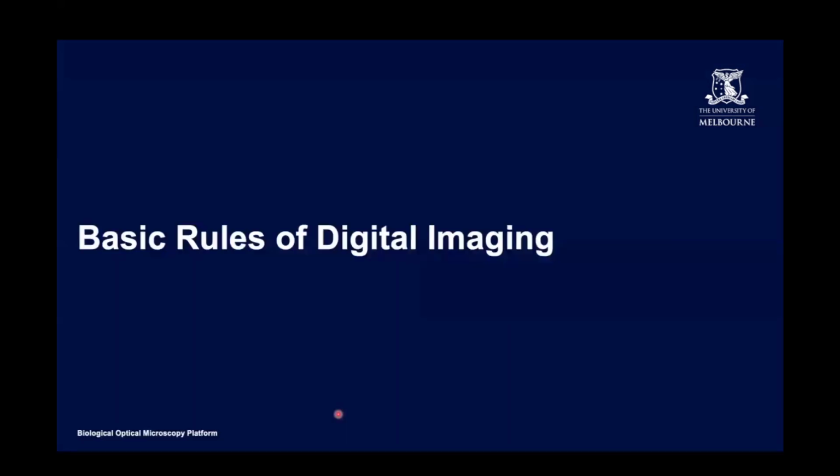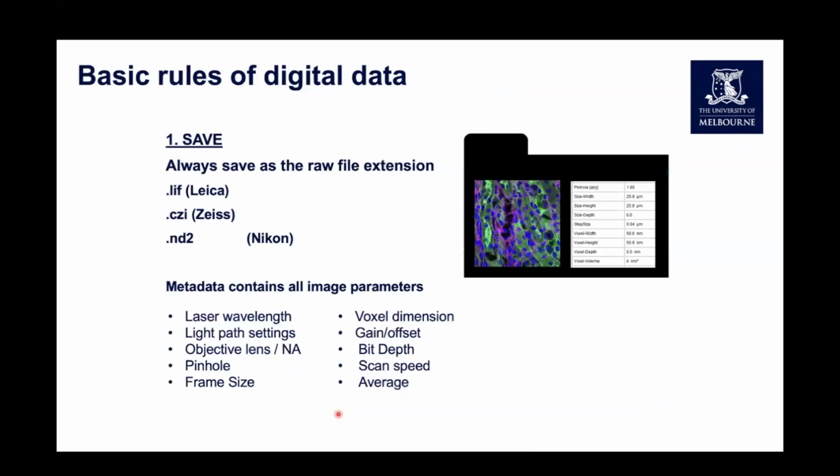Okay, you've acquired your data, so now what should you be doing with those images that you've taken? So the first thing, hopefully fairly obvious, is to save, but save it as the raw file extension. So there are some examples here from different vendors. If you can save that, it not just saves the image data, but it also saves the metadata as well.